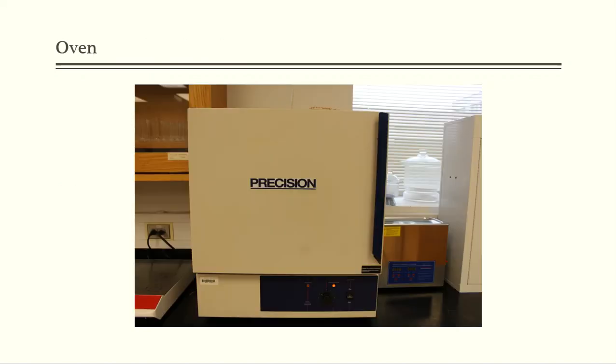So I go over to our oven in the laboratory. We have probably 6 of these ovens scattered throughout our laboratory facility. These ovens typically run around $3,000 to $4,000 a piece for these basic models that we have. And folks, it's just kind of like an oven that you have at home with a door. I mean, that's all that it's going to be.